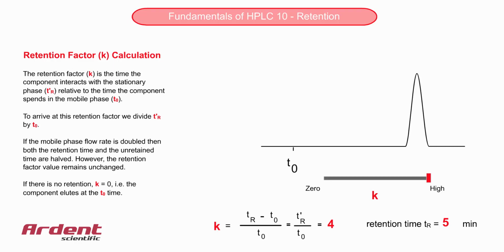This is an important diagnostic for HPLC troubleshooting, as we shall see in more detail in the module titled HPLC Tips and Troubleshooting, which is part of this HPLC e-learning suite.